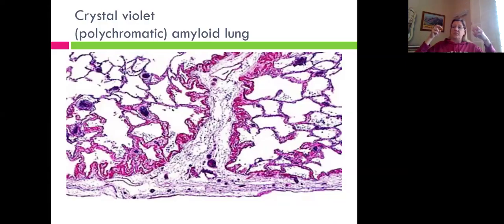Yeah. If you were to do this as Carson says, rapid screening, she's talking about taking a slide, dropping it in there for 5 minutes, pulling it out, mounting it aqueously, and everything is going to be purple. Okay, everything is going to be this color purple.